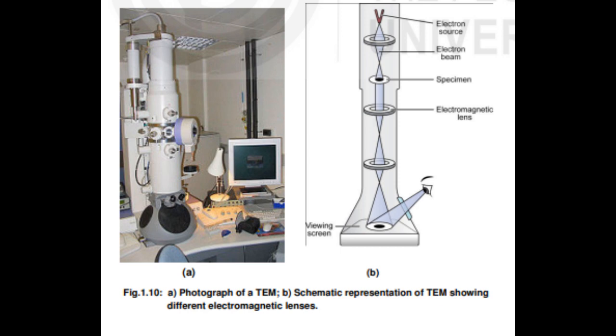The sample specimen needs to be processed before viewing under an electron microscope. The material sample is prepared in different ways. This is done either by cutting very thin sections of the specimen from a piece of tissue after fixing it in resin, or freezing it, or isolating a specimen and studying it after negative staining.